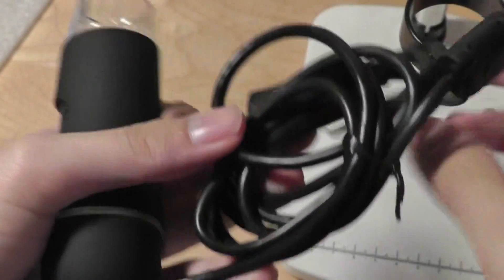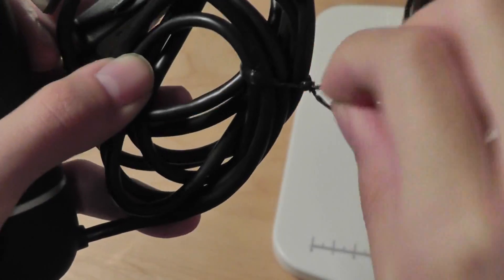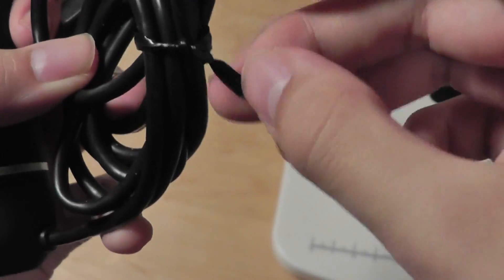The cord length — I would kind of prefer it to be a little bit longer. If you have a laptop you want this connected to, the setup is pretty easy. But if you have a desktop, the cord length could be a little bit limited and you might need an extension cord. It's USB 2.0, which is pretty handy.